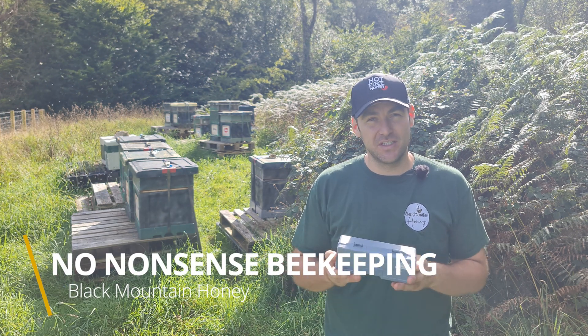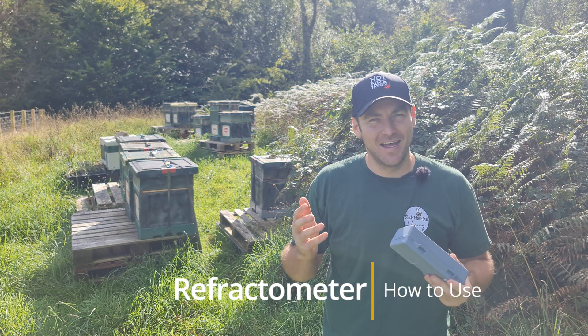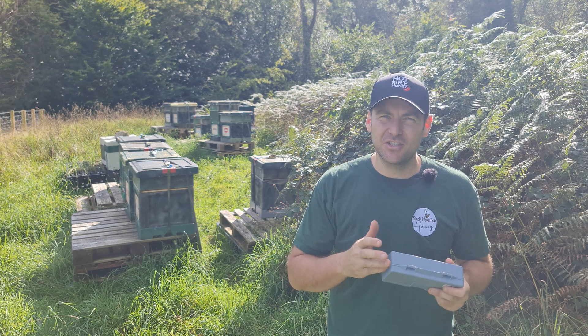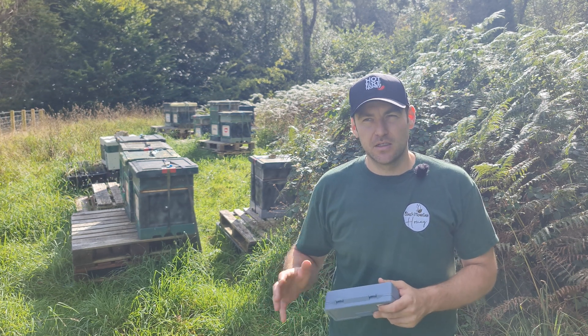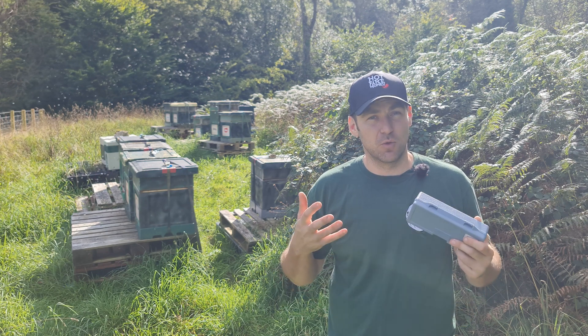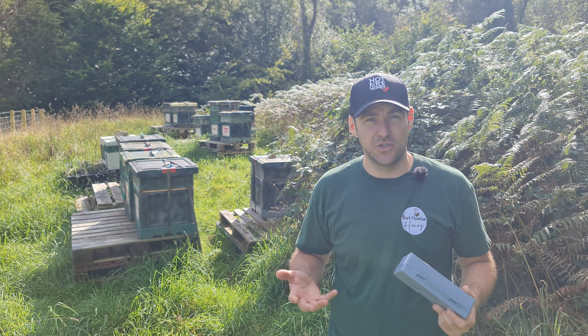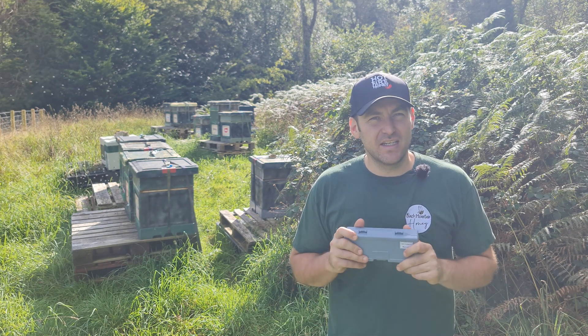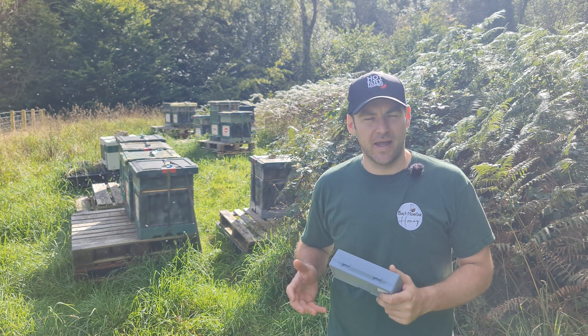I've had a number of requests for this video on how to use a refractometer, however you want to say it. What this device does is it measures the sugar content — called Brix — and it measures the moisture content as a percentage. Now, in terms of honey, you don't really need to worry about the Brix reading; it's not really relevant to what we're trying to work out here.